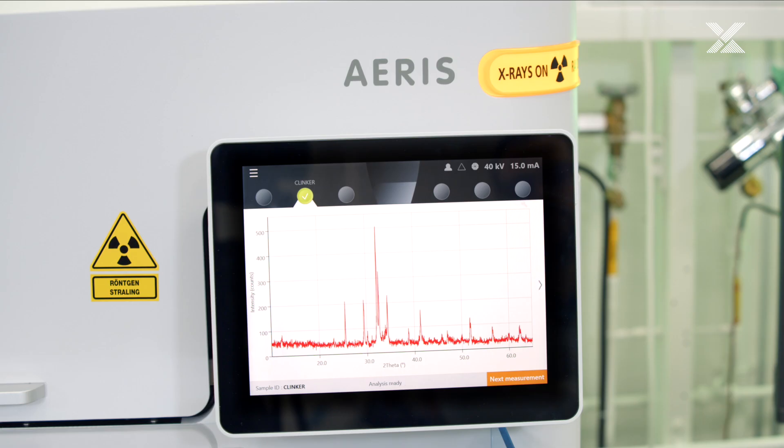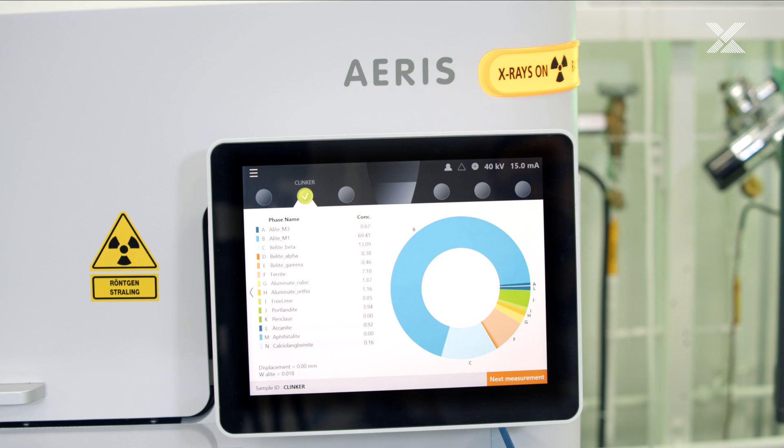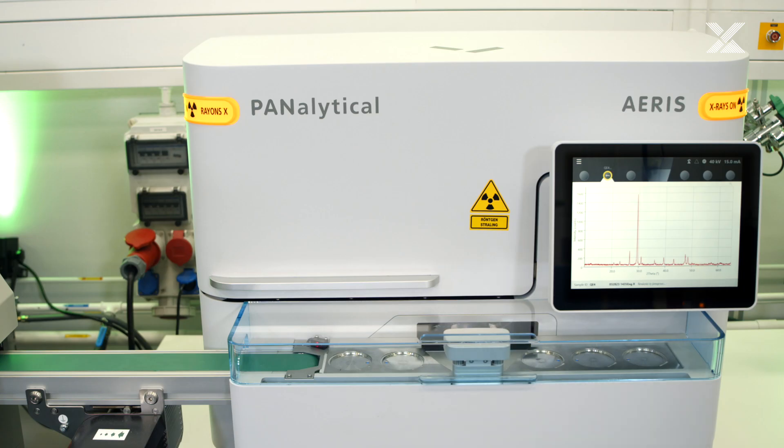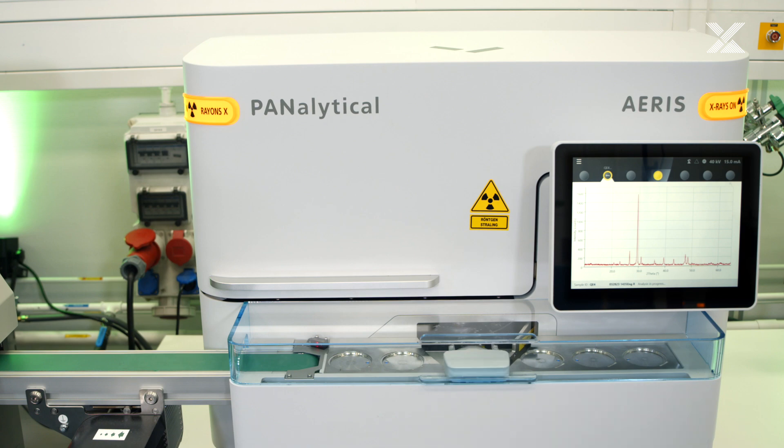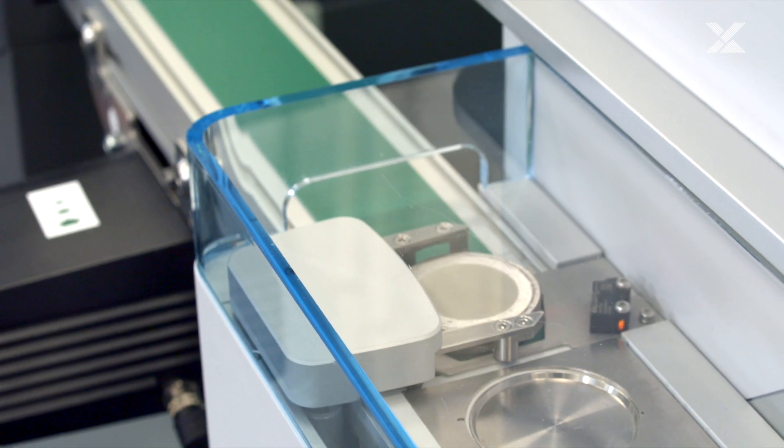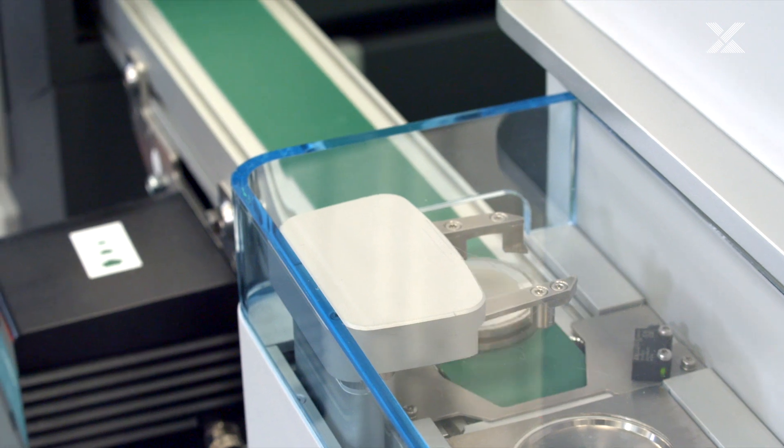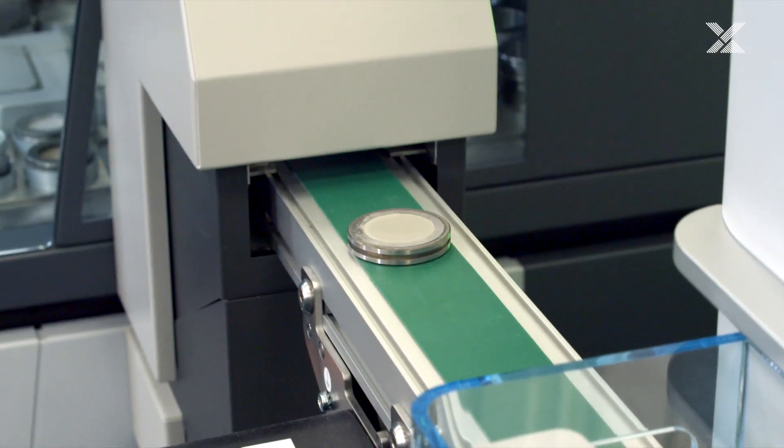It only takes minutes to generate easy to read results. Just like that, the sample is ready to return to the Zetium. Twinned, Eris and Zetium offer full material characterization by combining elemental composition data with phase identification.